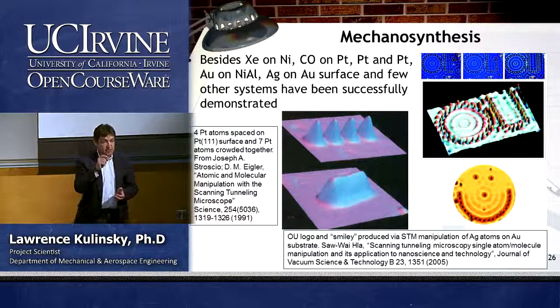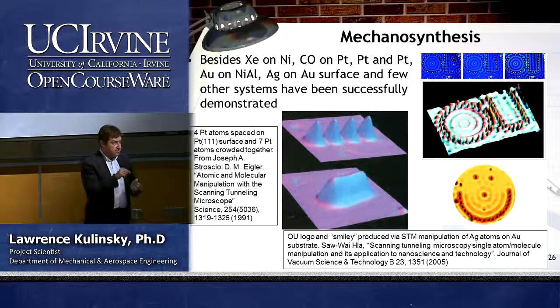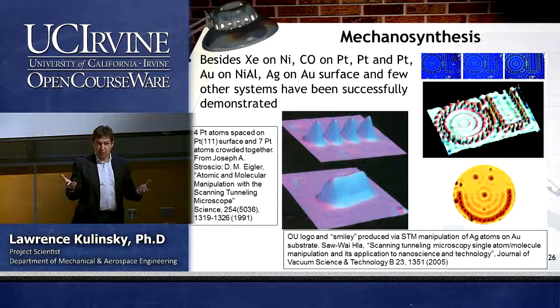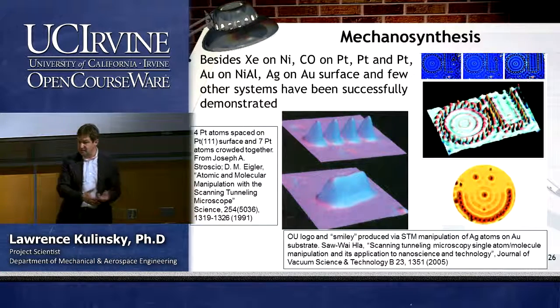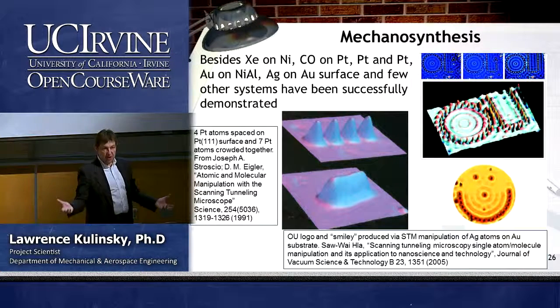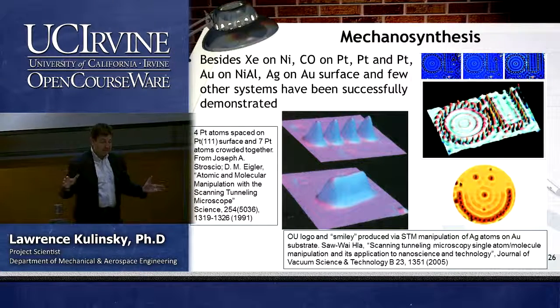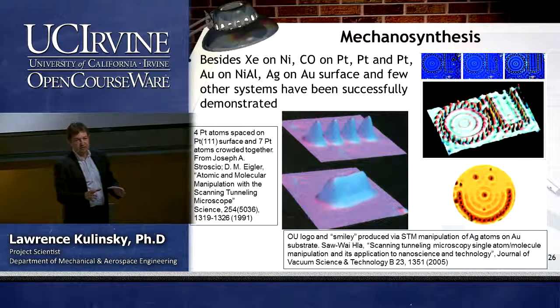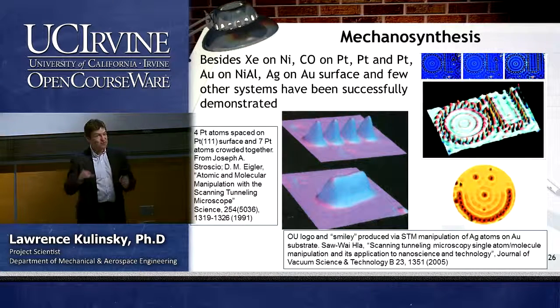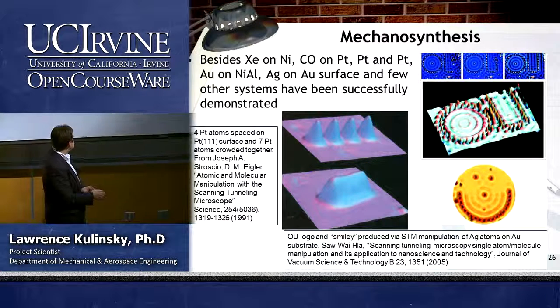What you can do, the big one, is you can actually store a lot of information on the surface. Because imagine that if you have one atom, it would be like 1. If you don't have an atom, it would be like 0, right? Ones and zeros. You can store a huge amount of information, theoretically up to the maximum possible on a unit of surface. Well, of course, there is also a drawback, okay? So we'll talk about the drawback of this whole wonderful technology in a second.